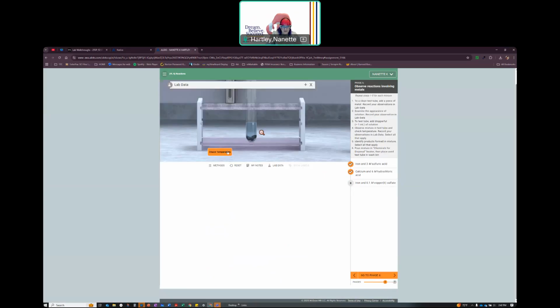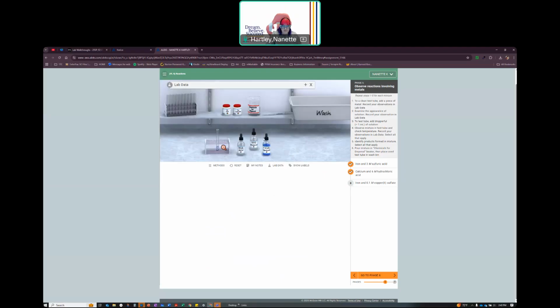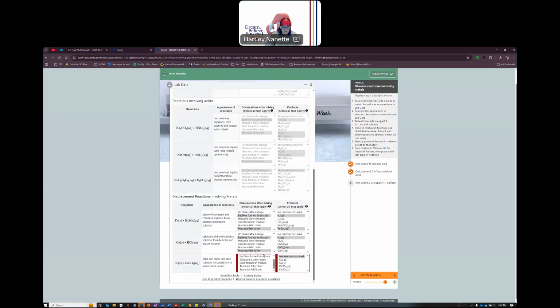I've seen nothing. The test tube does not feel heated. Doesn't feel hot, doesn't get cold, no solid.